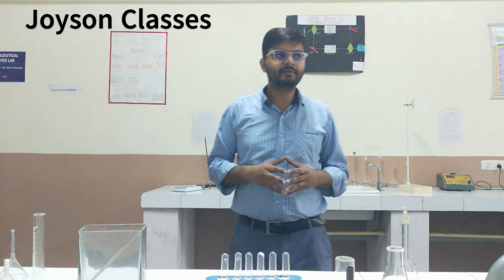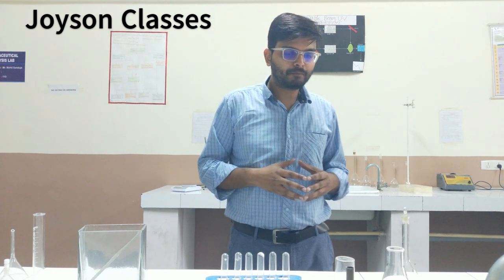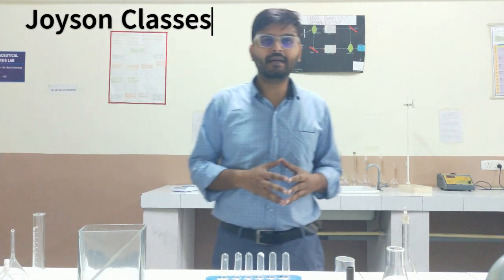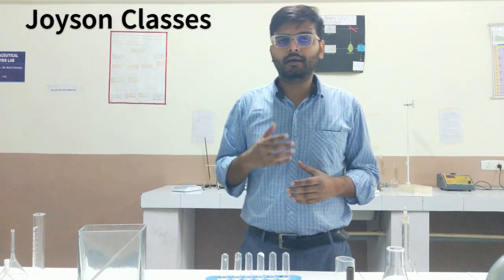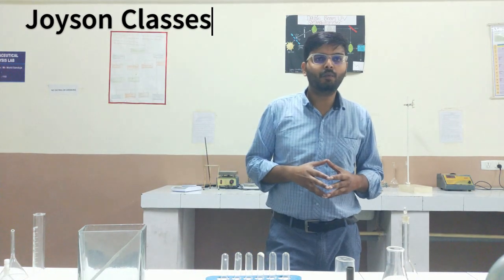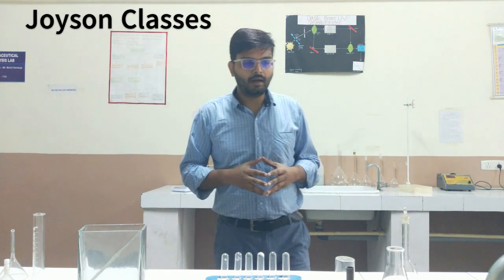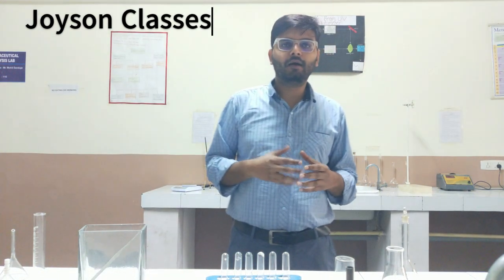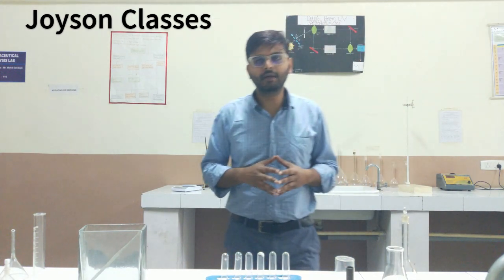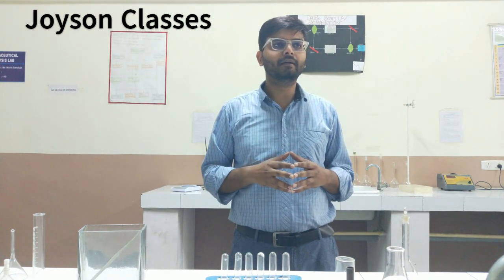I'm in the School of Pharmaceutical Sciences Department, and today I'm here to present the various glasswares that are used in the pharma analysis lab of first semester B.Pharmacy. Today we'll focus on the basics of glasswares, because many students don't know about the glasswares they use in their laboratory work.